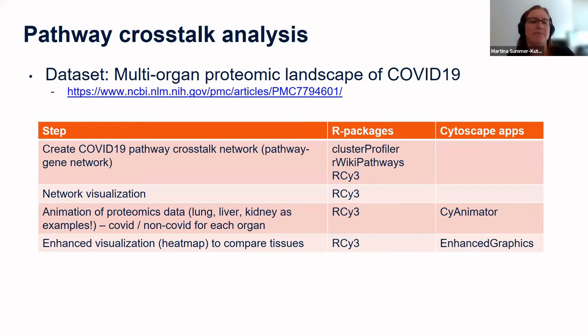Then we will visualize a multi-organ proteomic data set. So in this case, there is a paper where they did proteomics data analysis of COVID-19 patients, and they measured the expression in different tissues for COVID and non-COVID patients. And we're basically going to visualize that data.